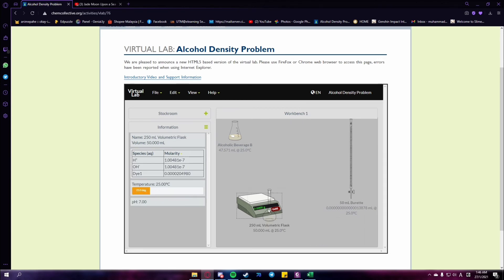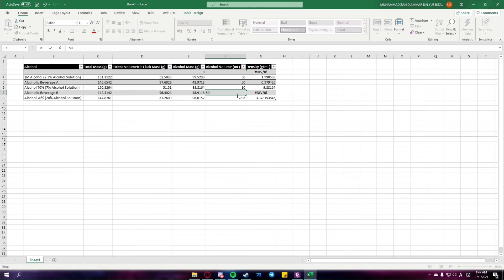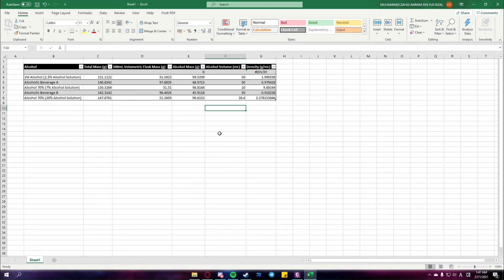The last procedure is procedure 6, which is to compare the density of alcoholic beverage A and alcoholic beverage B with the density of the 2.3%, 7%, and 20% alcohol solutions. Then categorize each alcoholic beverage into one of the 4 categories: less than 2.3%, between 2.3% to 7%, between 7% to 20%, or greater than 20%.